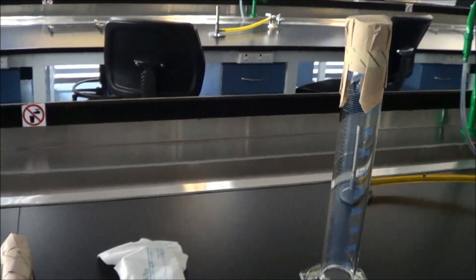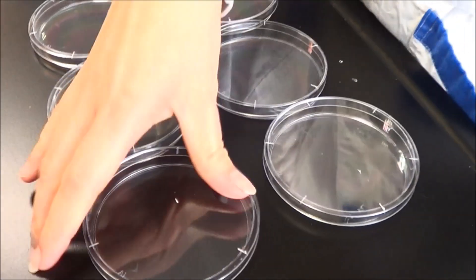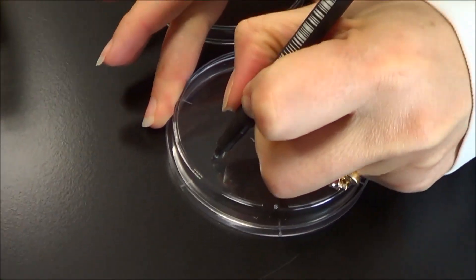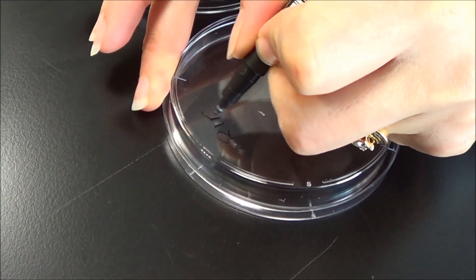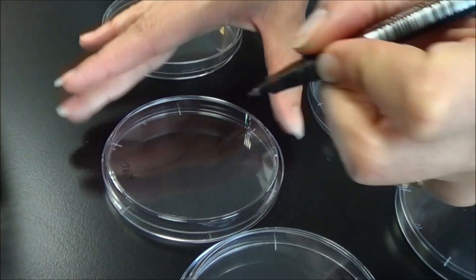The first thing you need to do when preparing your agar plates is labelling the base of the agar plates with the antibiotic that you will be adding. It's important to note that we always label the base of the agar plate and not the lid, as the lid may become separated from the base.